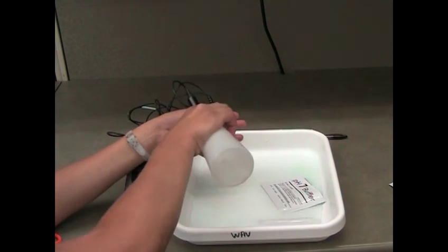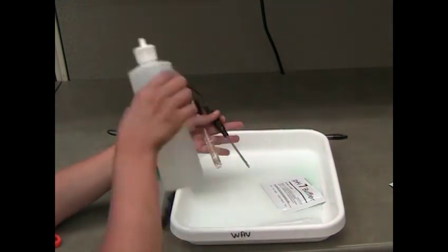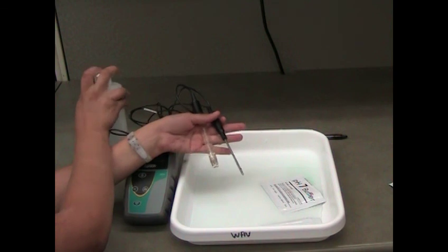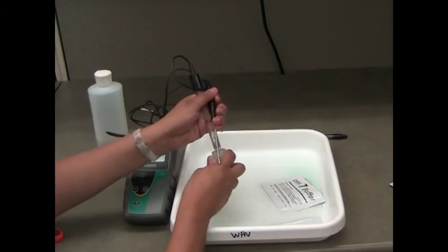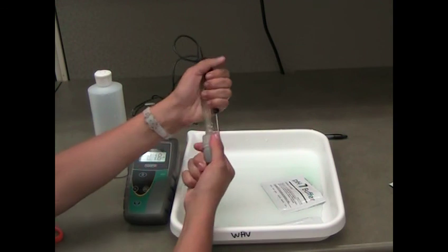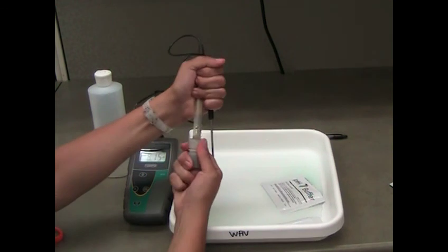When you are finished calibrating the meter to the pH 7 and pH 10 buffer solutions, rinse the pH probe with distilled water and replace it in the storage solution. Turn the meter off and head out into the field to take measurements.